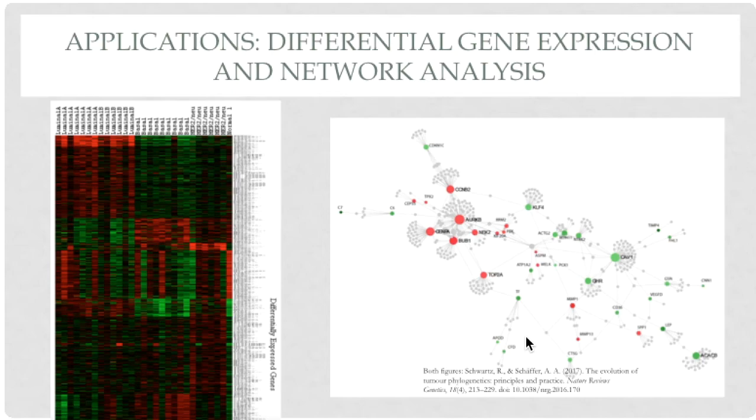samples of subtypes of breast cancer versus normal, where each row here is a gene, we will be able to see how exactly subtypes of breast cancer are different from normal samples. By doing this, among many other things, we will be able to figure out potential targets for treatment. For example, we can clearly see that Luminal A and B subtypes of breast cancer have an upregulation, represented by the color red here, in this group of genes, as compared to the normal sample here, which is down, as represented by the color green.